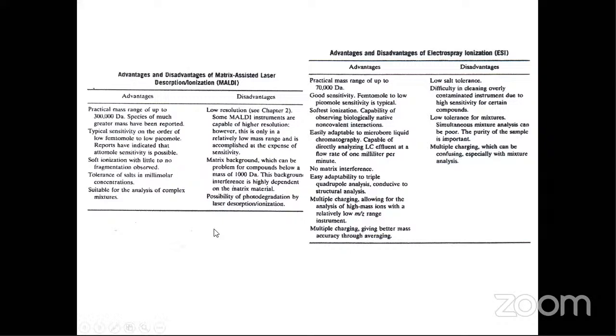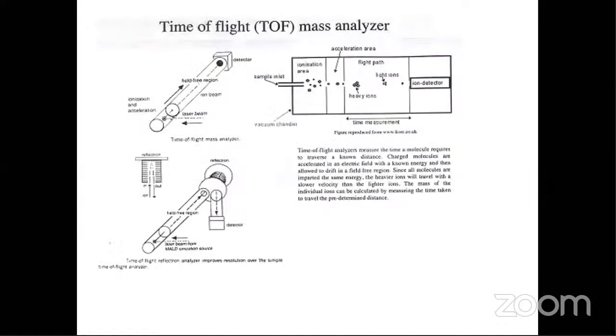So if you have too many charges taking place on the same protein, like I said, you may get the m/z peak at 10,000, 5,000, 3,000, 2,500 and so on, depending upon whether it's acquired a single charge, double charge, triple charge, four charge, respectively. So that's a problem we need to resolve or identify.